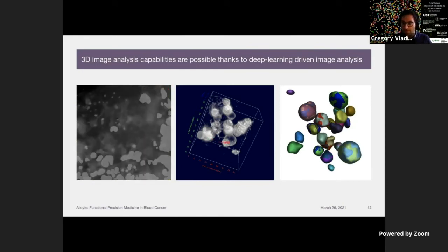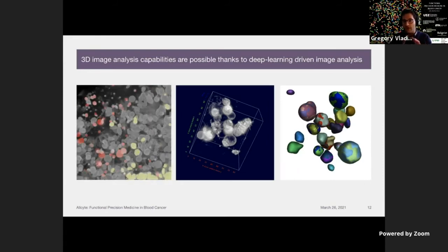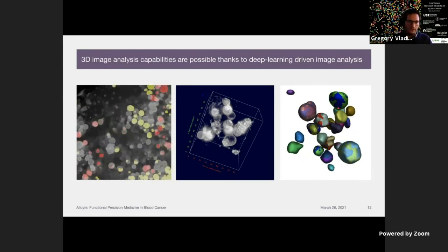Here we have one of our microaggregates. So again, these pieces that came out of the solid tumor, here in 3D, and then a reconstruction of this microaggregate. We believe that these microaggregates are really quite interesting biologically, especially when looking at solid tumors or what's happening in the lymph nodes. We can start to understand how these cell complexes occur or where they are, and then how drugs are changing these. Is there more activation, and some of them less activation? Are we getting, potentially, one could imagine, CAR T integration into some of these as well? We haven't really gotten that far yet, but we're starting to look at what else we can image rather than just 2D planes. And we have this nice spatial paper from 2017, but can we also do this in 3D?